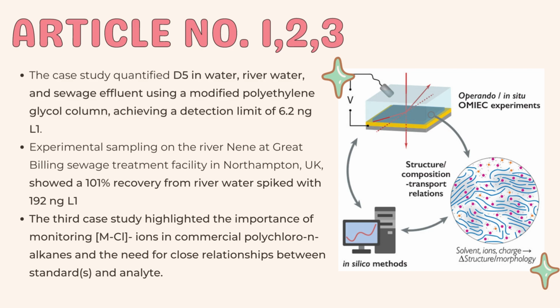microliter by auto injection of injected analyte and primary standard solution, multiplying by R, the ratio of the integrated SIM signal of the monitored ion of the internal standard in the primary standard solution to its integrated SIM signal in the analyte solution. Therefore, in the current example, accuracy of the analytical method and choice of standard matter for quantitative studies.